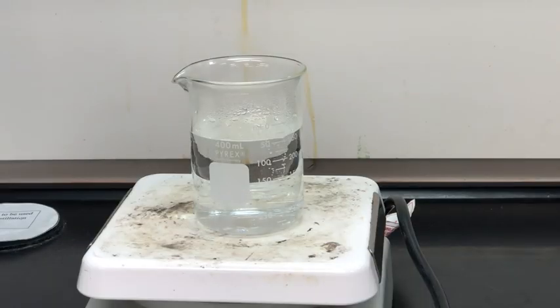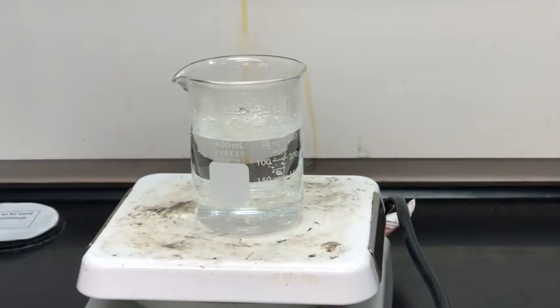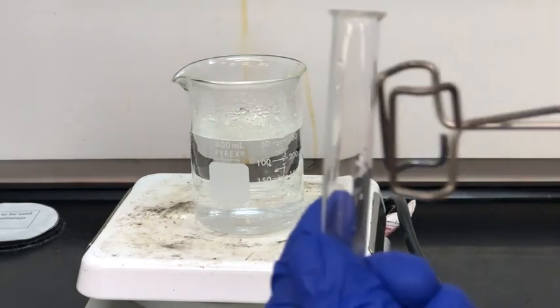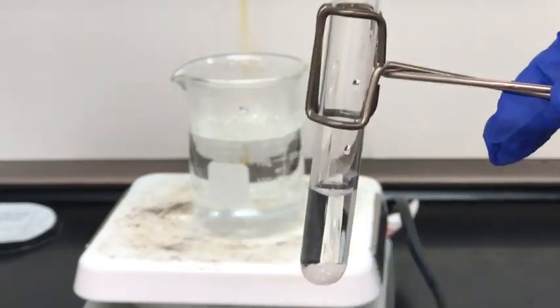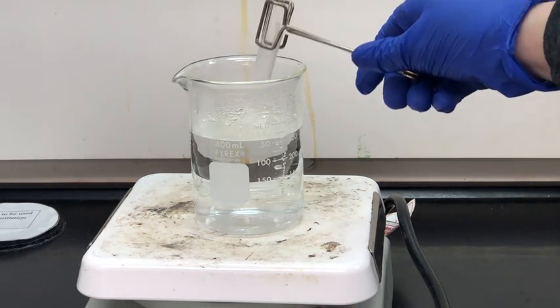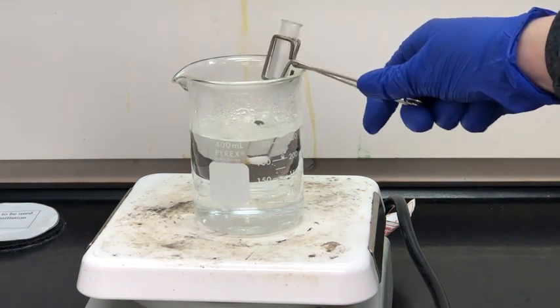After a few minutes boiling has started, so now we need to add our test tube with our solution in it. We'll use test tube tongs to hold the test tube in place and set it into the beaker, allowing the sample inside the test tube to boil so that anything that can dissolve will dissolve.